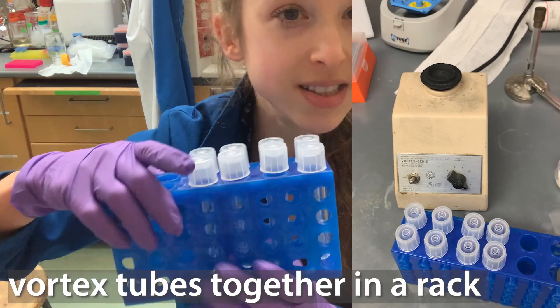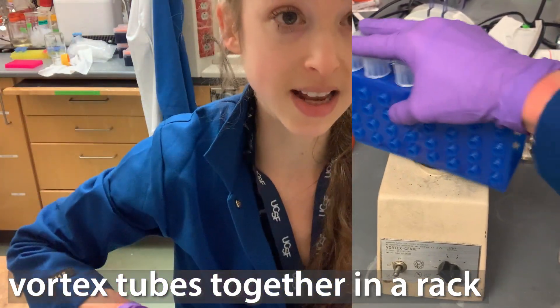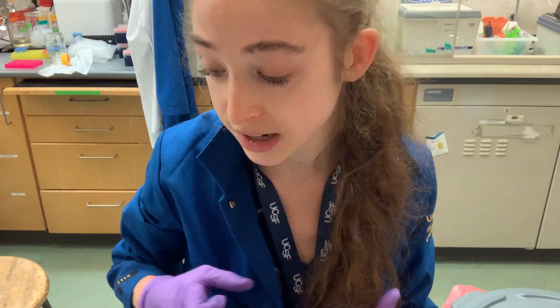This works great if you have single tubes. But what if you have a lot of tubes? In that case, you can stick them in a rack, stick your hand tightly on top, and then vortex them side to side. Both of these approaches are going to be great for loosening things up and getting the pellet broken up into smaller pieces off the sides of the container, but there's probably still going to be some clumps.